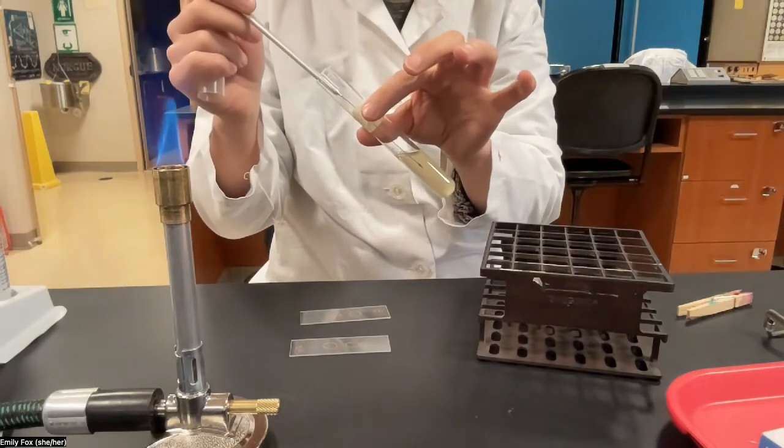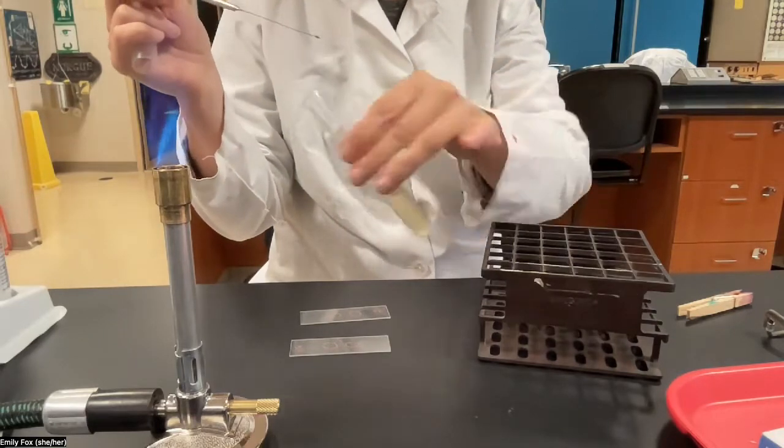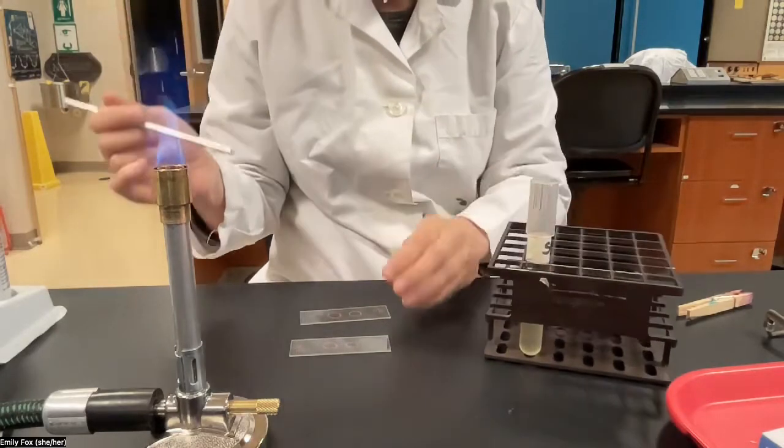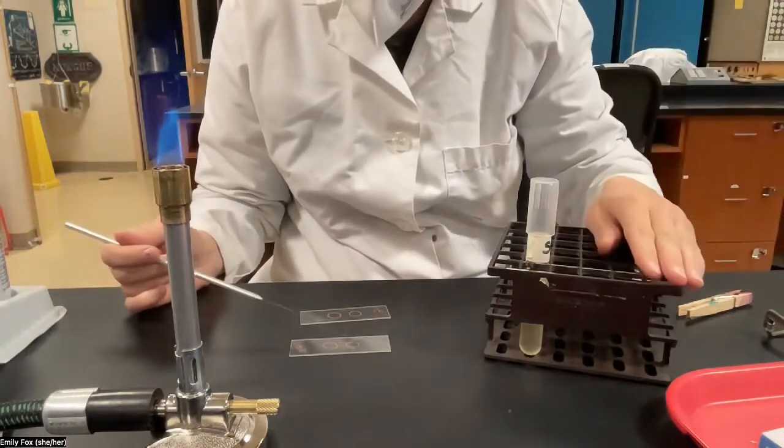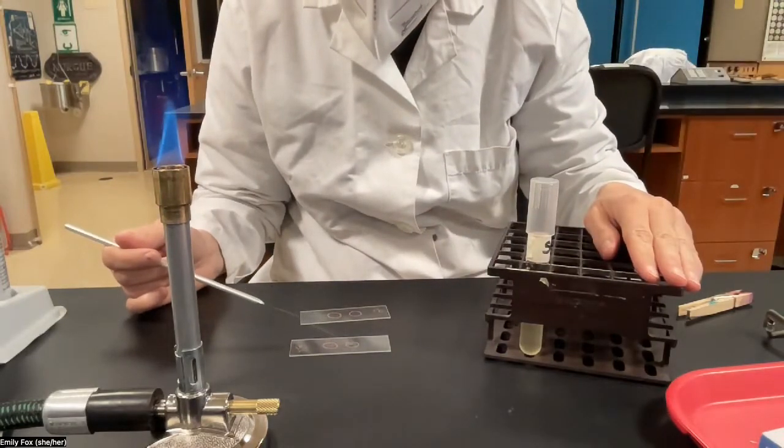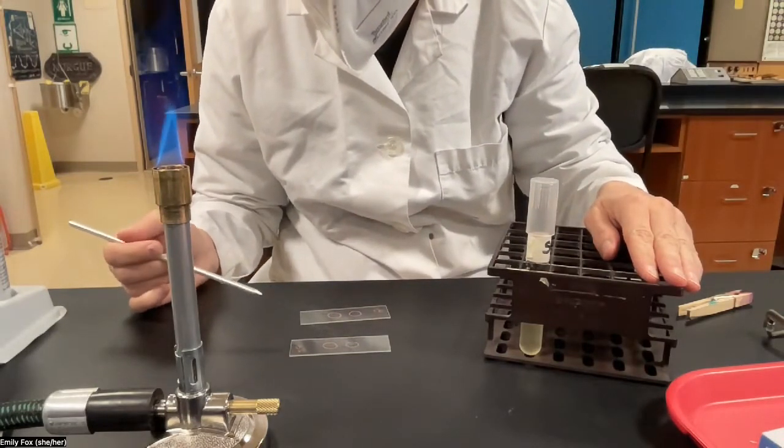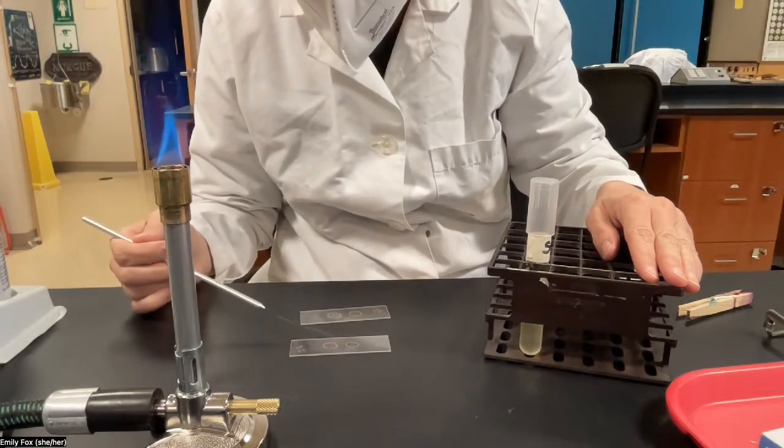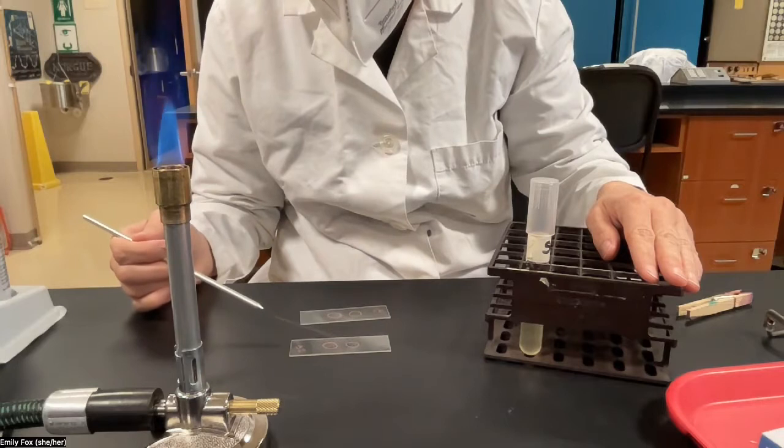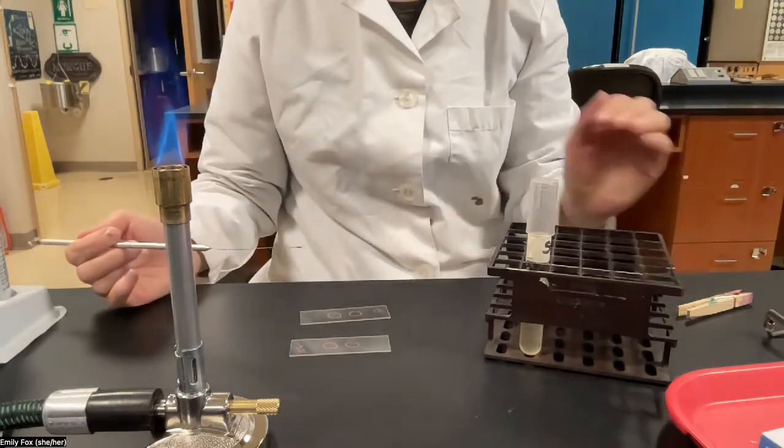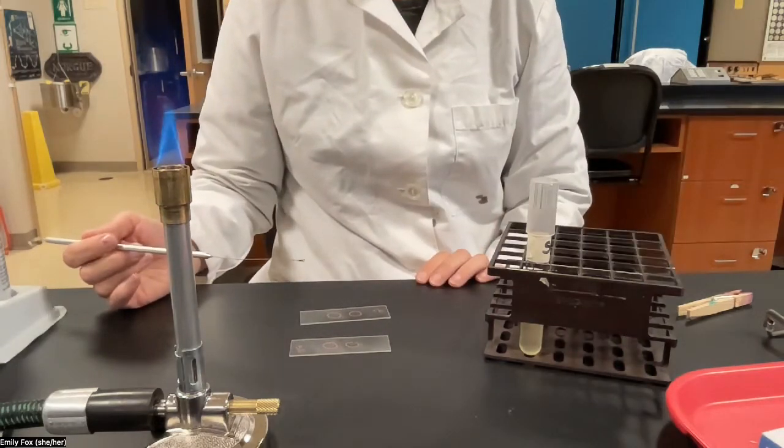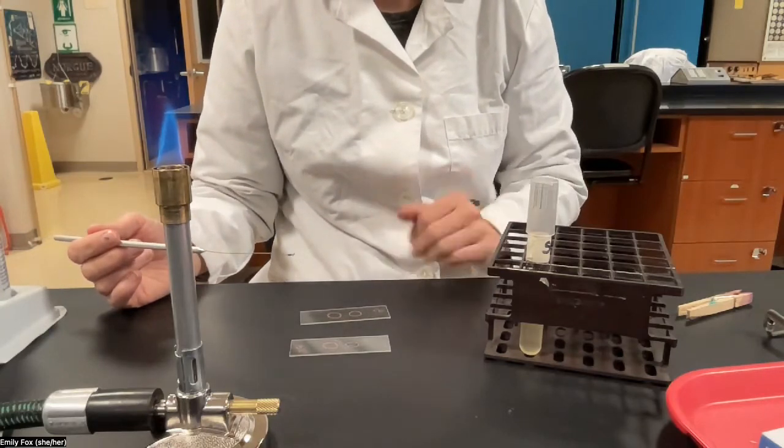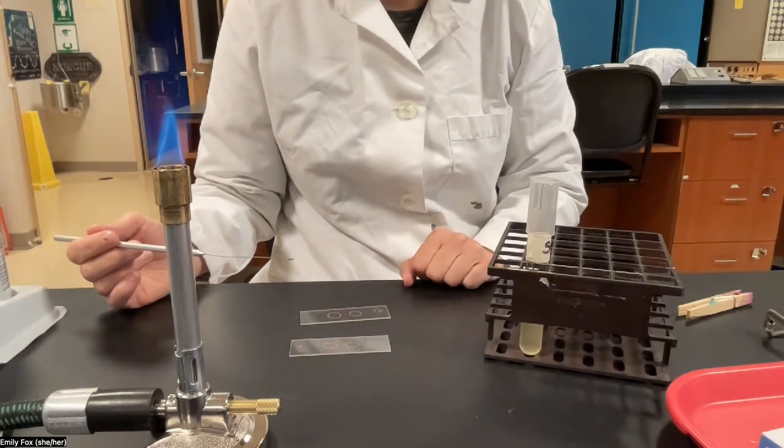Once your loop is cool, you can reach in and get a loop full of bacteria. Put your tube down and you're ready to add that bacteria to one of your circles. And you're just going to smear it around, filling in the circle. The purpose of the circle is to let you know where you put your bacteria when you're ready to look at them on the microscope. Now you have a nice circle to aim for with your objective lens.